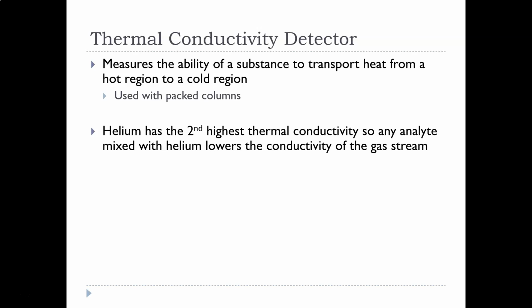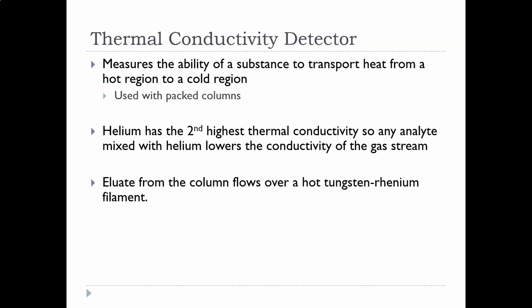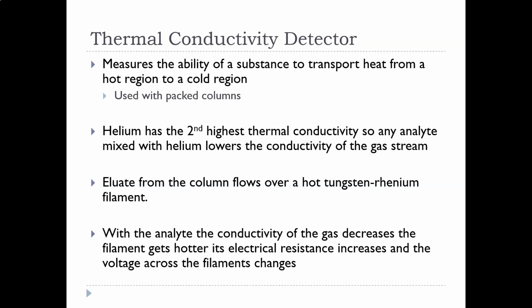Then it's going to compare the thermal conductivity of the analyte with that of helium. Based on that, because of its conductivity, it's able to get a measurement out of it. So basically it's measuring the thermal conductivity, and it gets a measurement based on that.